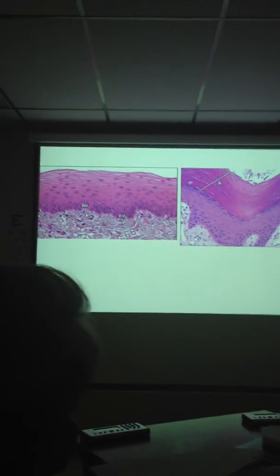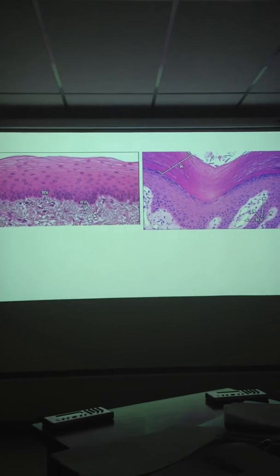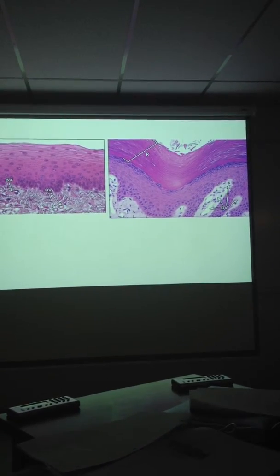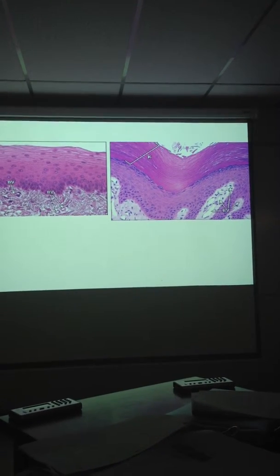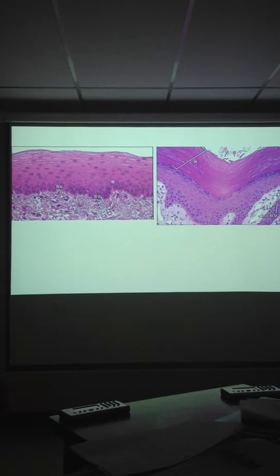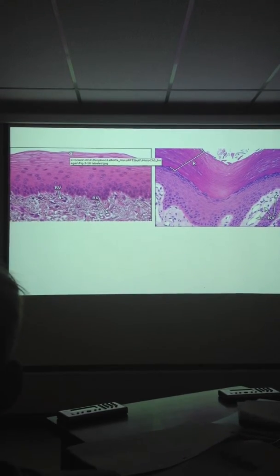And how about these bumps? Friction ridges or not dermal, epidermal ridges. On the left, type? Non-keratinized, stratified squamous.